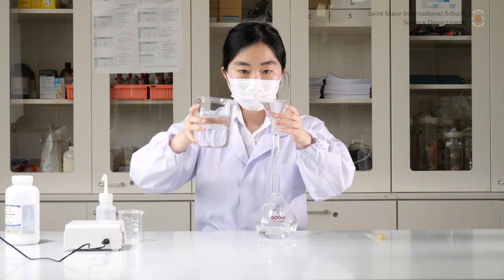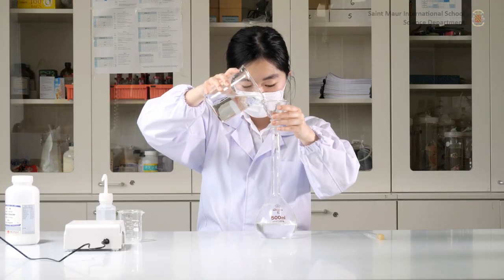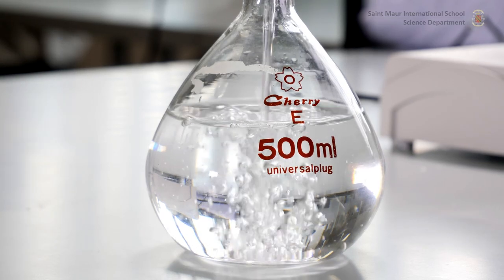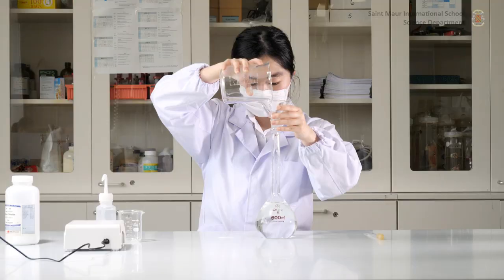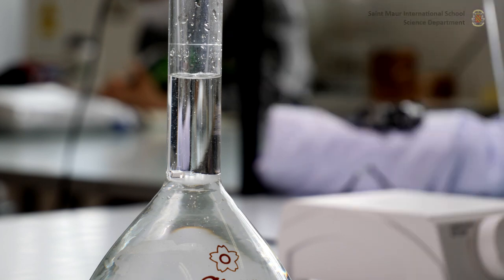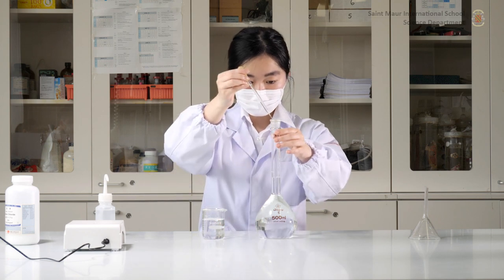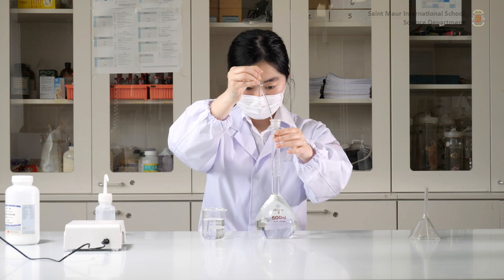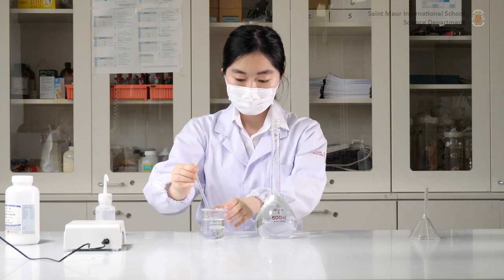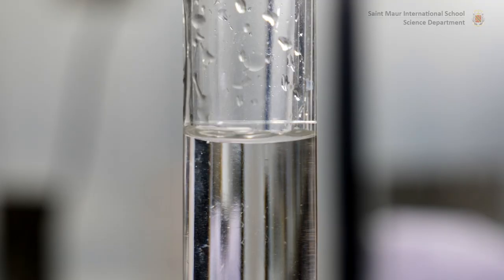Fill a larger beaker with distilled water and slowly pour it into the volumetric flask. When you get close to the line on the neck of the volumetric flask, use a teat pipette for more accurate dispensing. Pour until the bottom of the solution's meniscus reaches the line at eye level.